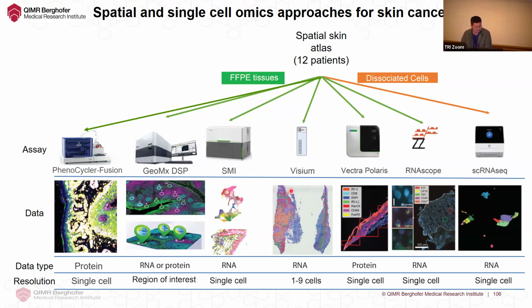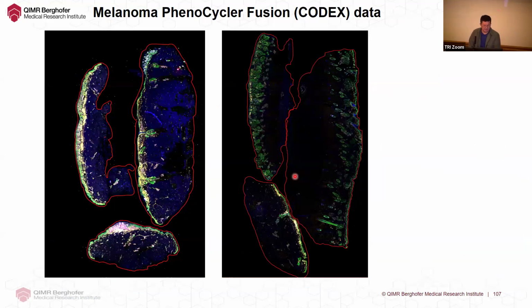And for today, I will mainly focus on the PhenoCycler-Fusion platform, which measures protein at single cell resolution. So those are the 6 samples that I will analyze during this talk.